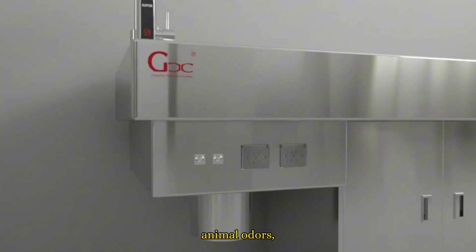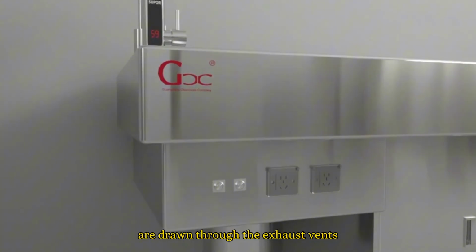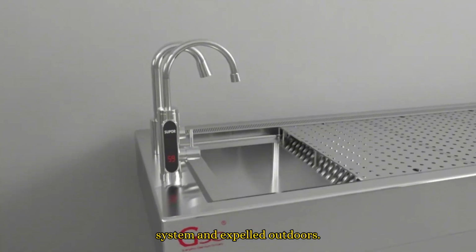Anesthetic gases, animal odors, and other byproducts generated during experiments are drawn through the exhaust vents around the top of the cabinet into the ventilation system and expelled outdoors.